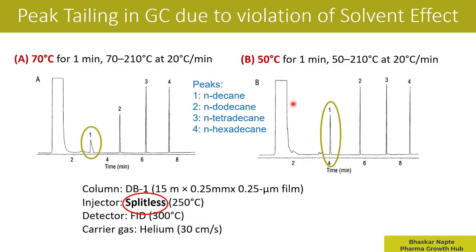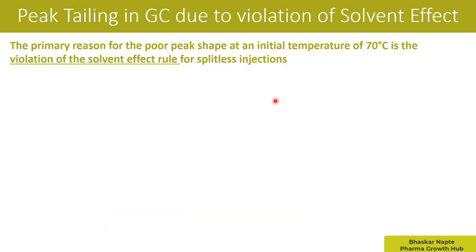The point of discussion is: why did this happen? At 70 degrees Celsius the peak got distorted, whereas at 50 degrees Celsius the peak is very proper, symmetric, and well accepted. The primary reason for the poor peak shape is the violation of the solvent effect at 70 degrees Celsius.